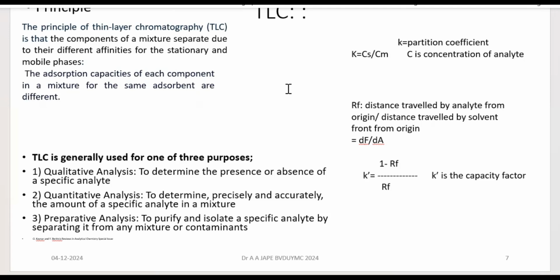TLC is generally used for one of three purposes. That is qualitative analysis, to determine just the presence or absence of a specific analyte in a given sample. Second is quantitative analysis, where you are going to determine precisely and accurately the presence of the analyte and quantify its amount that is present in the mixture.